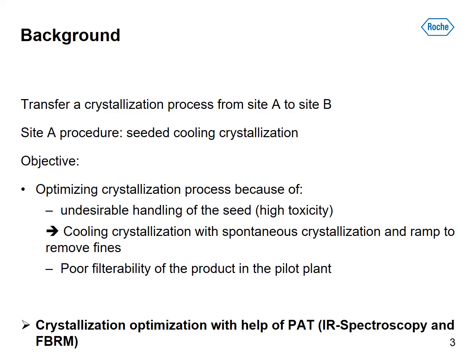We received the crystallization process from another site with the mission to develop it into a robust process. The procedure was a seeded cooling crystallization of a highly toxic product. It should be tested whether it is feasible to omit the seeding by running the process with a spontaneous crystallization. Furthermore, the product should be optimized in terms of filterability at larger scale.